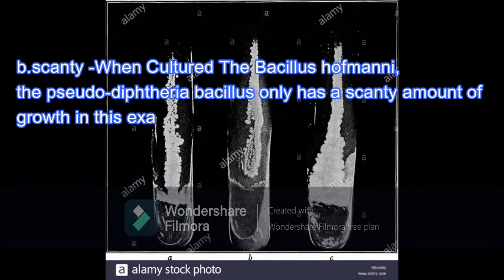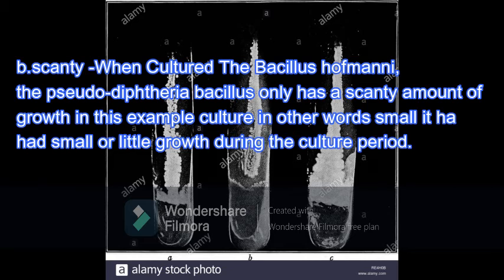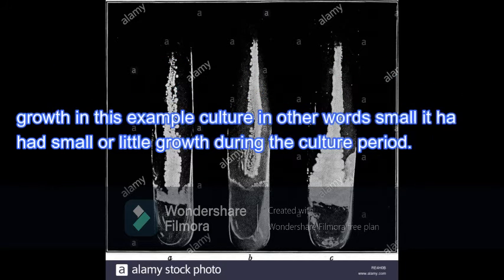Scanty. When cultured, the Bacillus hoffmanni, or the pseudo-diphtheria bacillus, only has a scanty amount of growth. The culture, in other words, has had small or little growth during the culture period.